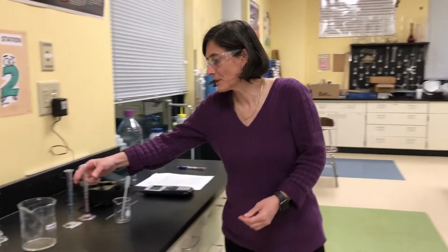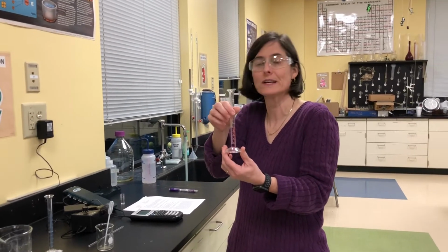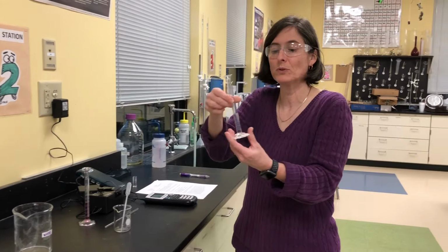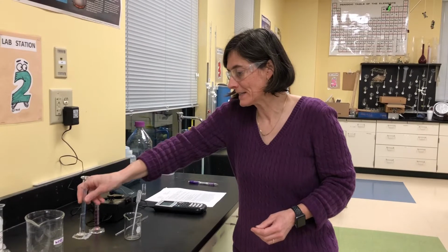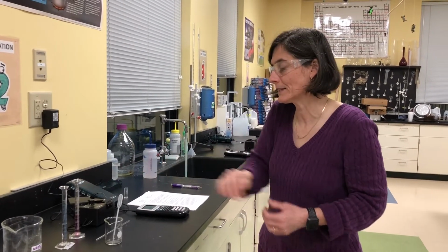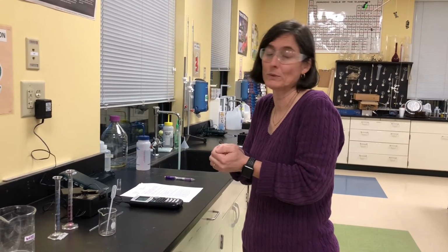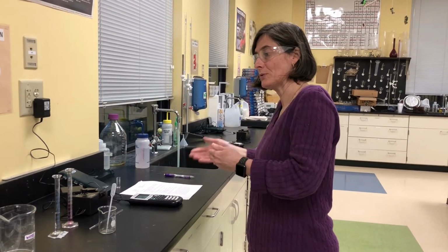Hello, chemists. Today what I'd like to do is give you an overview of the lab that we're going to be conducting this week on kinetics. Specifically, we're going to be using a purple biological stain called crystal violet that's a very, very dilute concentration. And we're going to be reacting it with 0.10 molar and 0.20 molar sodium hydroxide. The big picture idea is that when you combine these chemicals, at first it will be purple in color. As the reaction proceeds, it will eventually go to a clear solution.